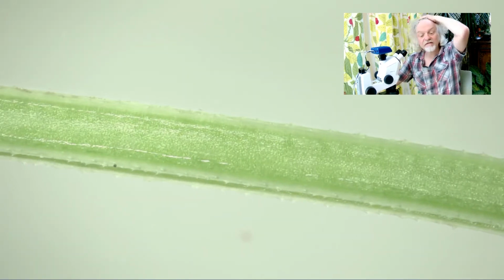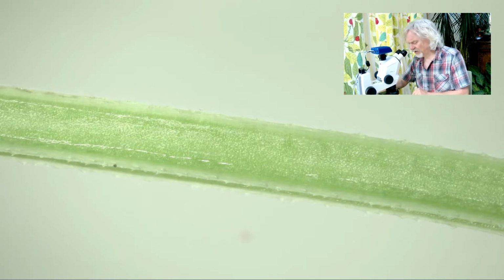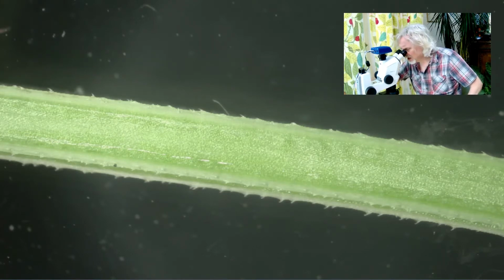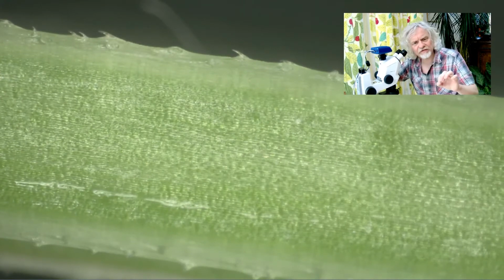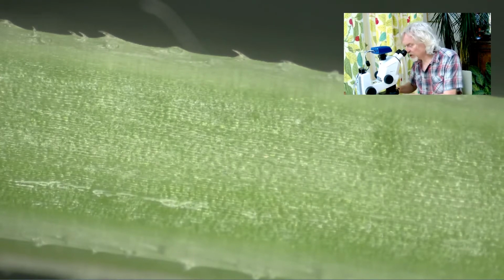The stem is actually very, very angular. I'll maybe show you that later. But if I zoom in, you can't really see that much detail. It might help if I did this and put some black behind it. This puts the light illumination at a funny angle on it. But if I zoom in on this stem, you can begin to see that the stem is covered in, or at least along the edge of the stem, there are all these little hooks. Now, there aren't actually that many. I was slightly surprised. I thought there were going to be many more hooks on the stem, because the stem really does feel very sort of hooked.